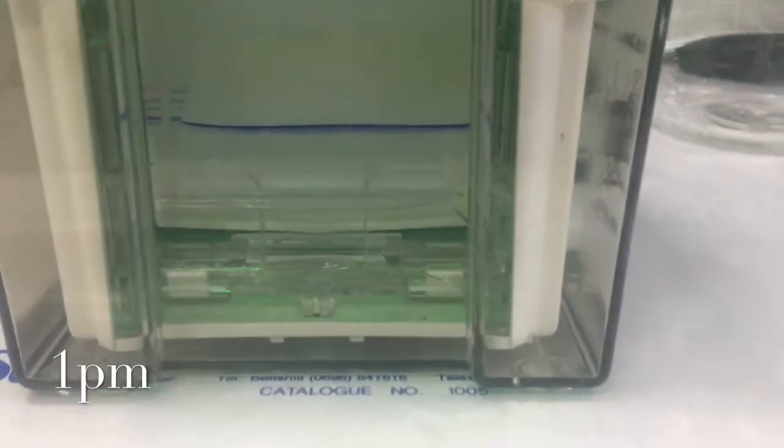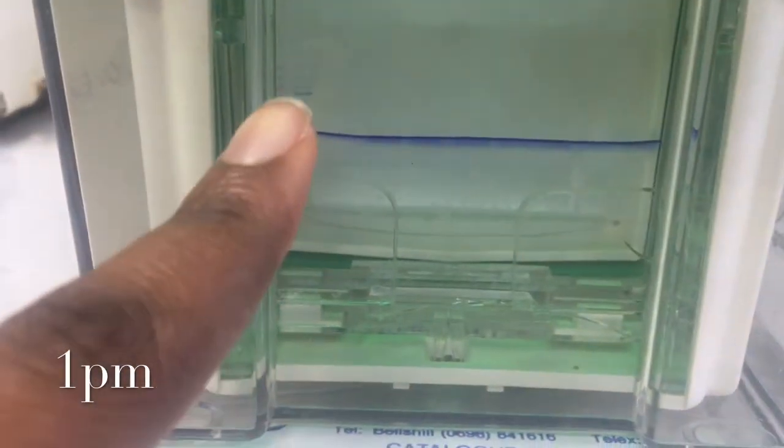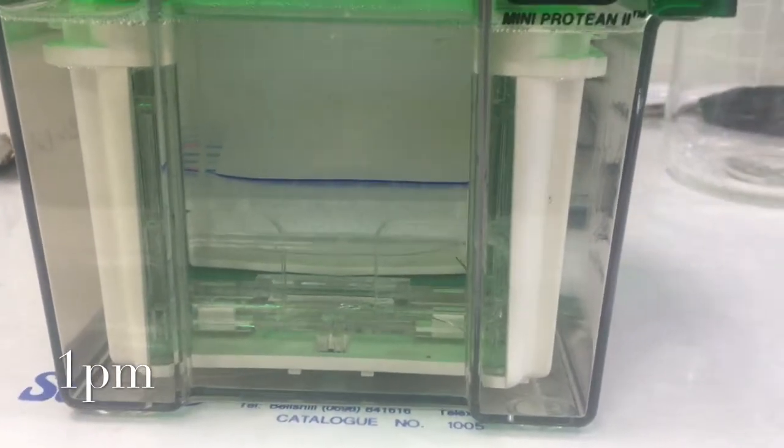You can see it's working really nicely now and you can start to see the ladder right there. I'll give it a few more minutes and come back.